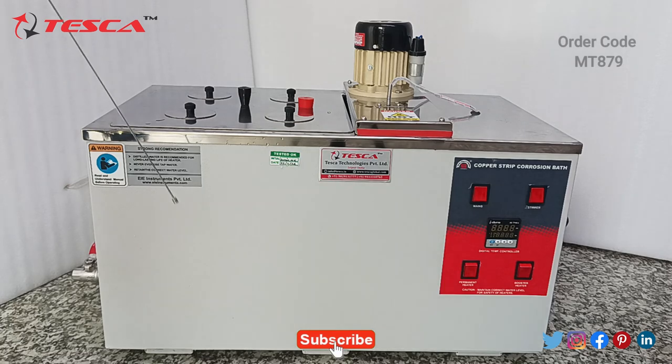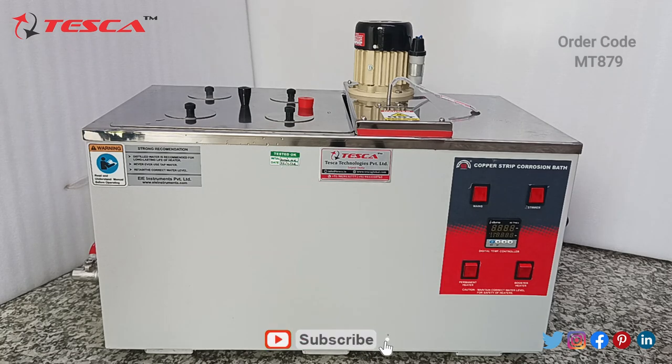This is the water bath in which you should pour distilled water for long life. Don't use tap water. I fill the distilled water in it. This is the main motor attached to the stirrer.